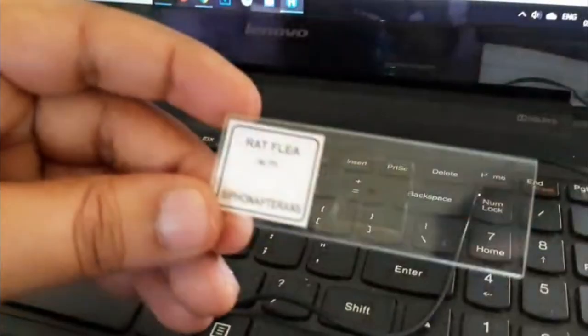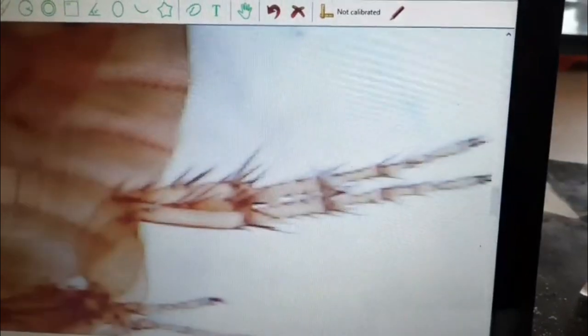This is the rat flea slide. I'll put it on a white background and focus on it. You can see the mouth parts, the body segmentation, and the abdomen. Let me show you the other side — the hind legs, the bristles, and the claws on the legs can also be easily seen.